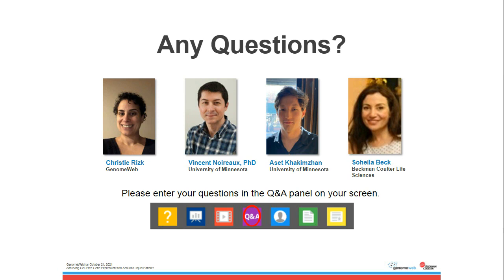Great. So Aset, could you tell us what the typical volumes are that are transferred and then dispensed in the destination plates? Usually we will do 2 microliters. That is our standard, like 95% of experiments. Sometimes we go down to 0.5 at first, perfectly well. We still get very good expression with our benchmark circuits. And then we go up to 5 microliters if we want more volume. That also works very well. We just have to adjust for the oxygen intake of the reaction, so we have to play around with the parameters of the reaction. But that's a very small thing to do. And so it always works.